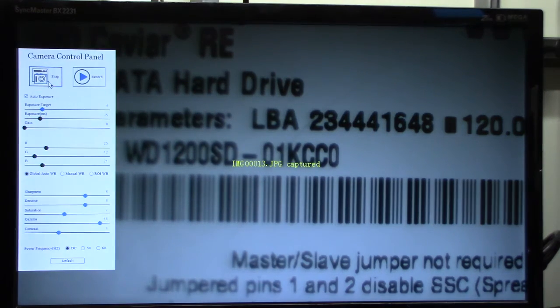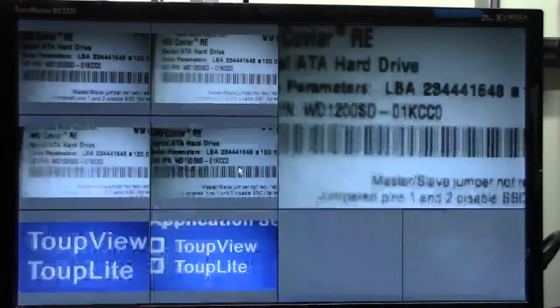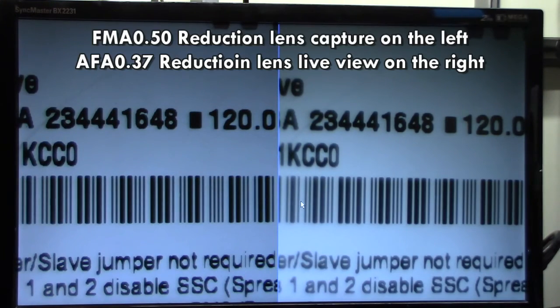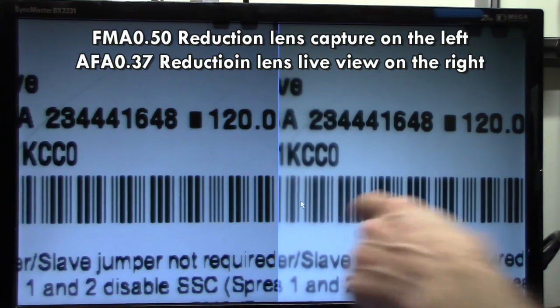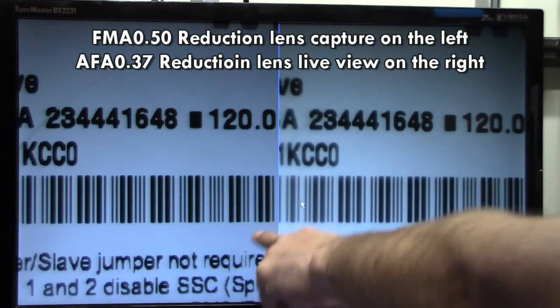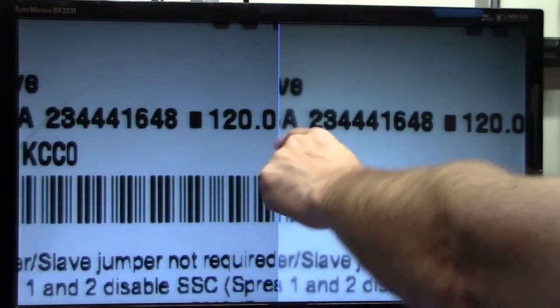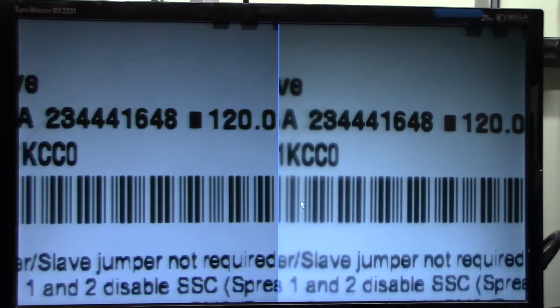We'll take a snapshot and go to compare again. Let's compare it to the first 050 image, which was this one. I'm pretty sure we can agree that the magnification is about the same — the font's about the same height, the barcode's about the same height. We got a clearer zero here, a clearer zero here, except we got a much more clear everything else. That's the best I'm going to do.